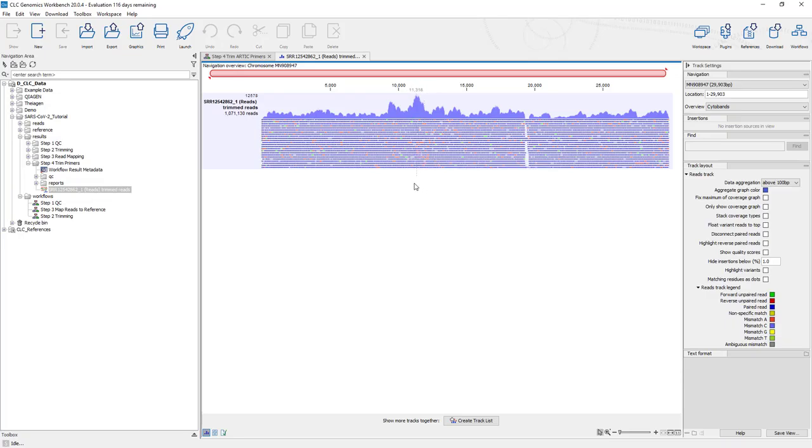Okay, so from here on, the next few videos, we're going to go a little bit into indels and structural variants, and then reperforming a local realignment based on some guidance from those indel and structural variants, and then move on to basic variant detection.